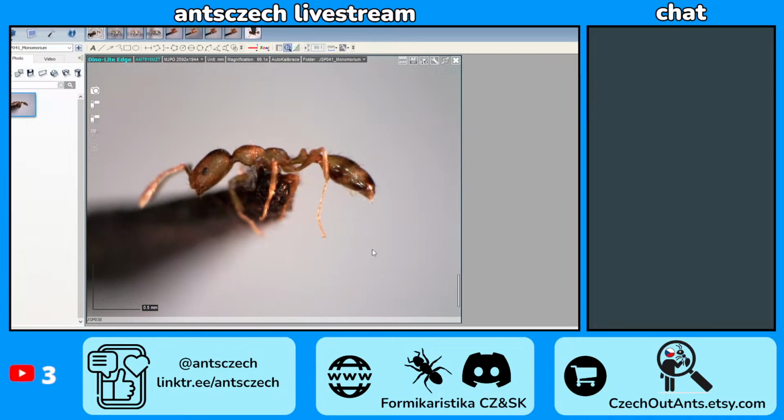You will know after I take a picture. So let's test if the leg is still in the way. It is. Oh damn, this is painful.